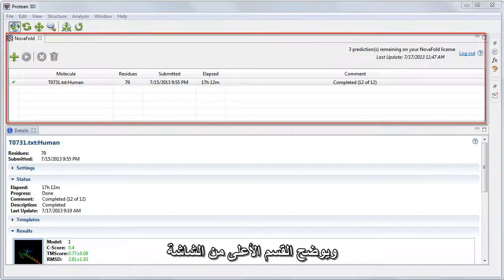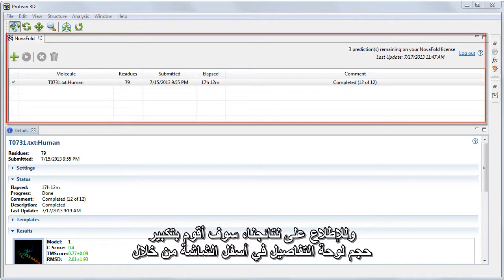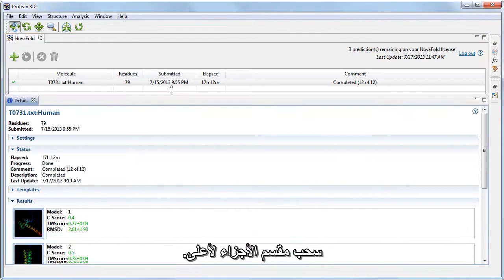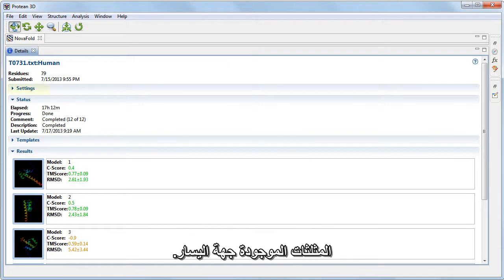The top part of the screen shows what the NovaFold panel looks like after all 12 of 12 steps have been completed. To see our results, I'm going to maximize the Details panel at the bottom of the screen by pulling the pane divider upward. The Details panel contains five sections that can be shown or hidden using the triangles to the left.